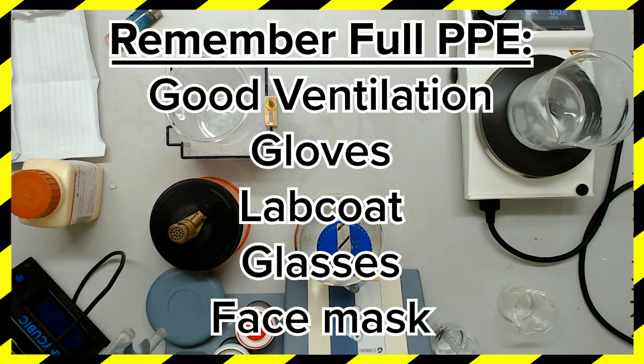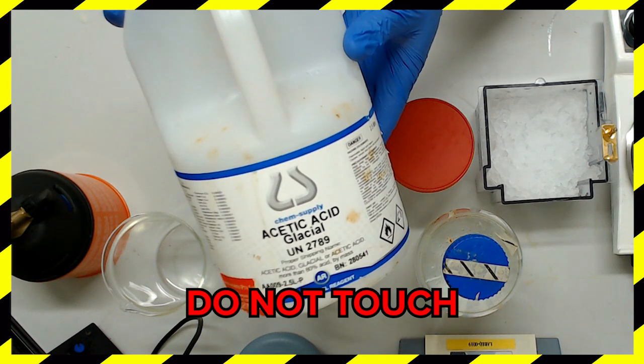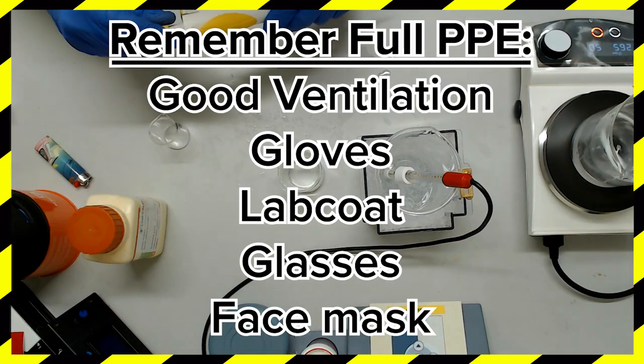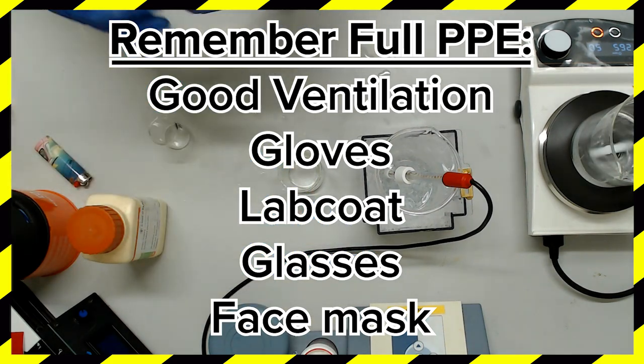Like Aesop's lion and the mouse, familiarity breeds complacency. Next on our list of dangerous substances is glacial acetic acid - the keyword being glacial. It's a lot stronger than vinegar. Another extremely corrosive compound - be extremely wary and continue to wear your full PPE.